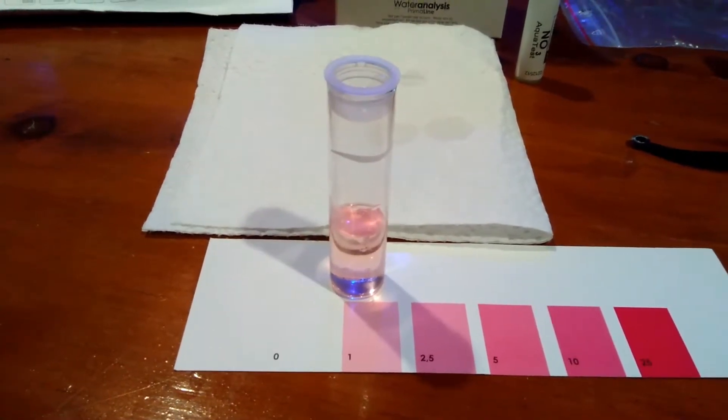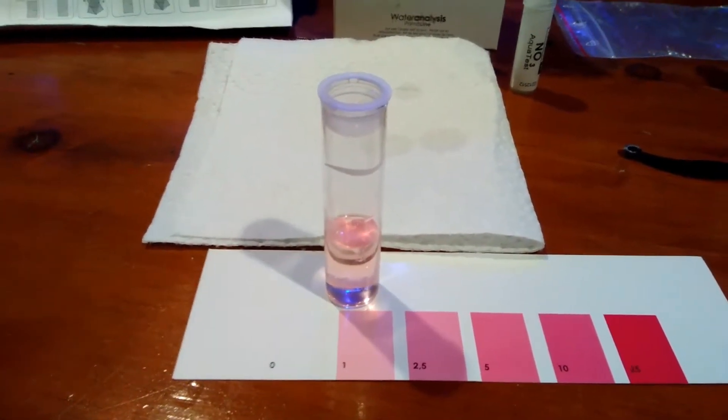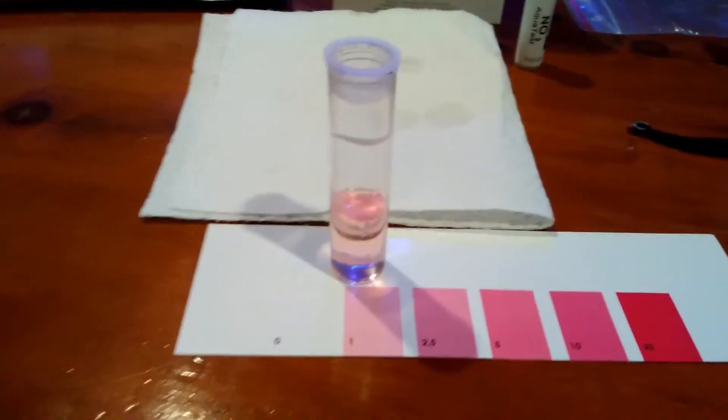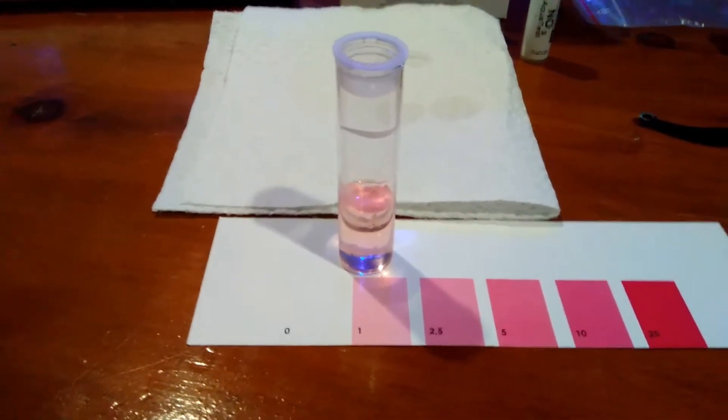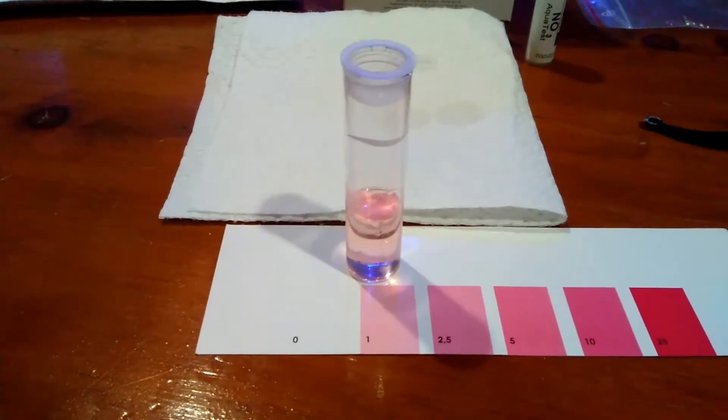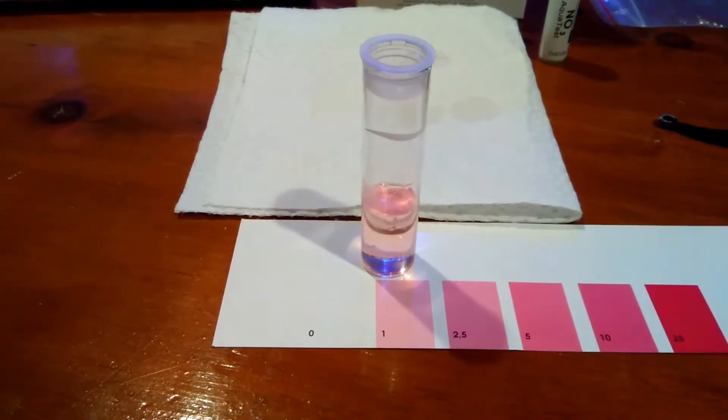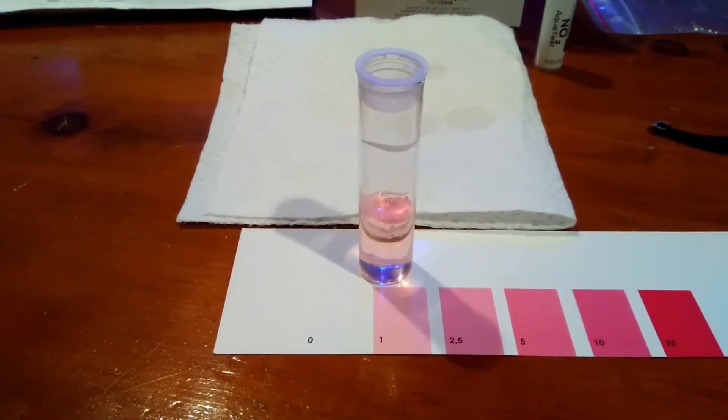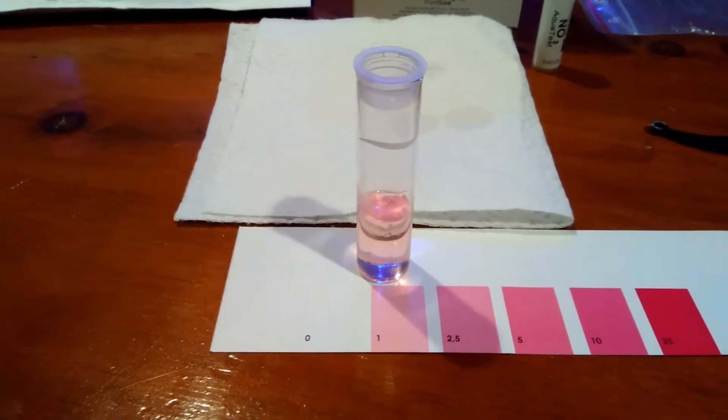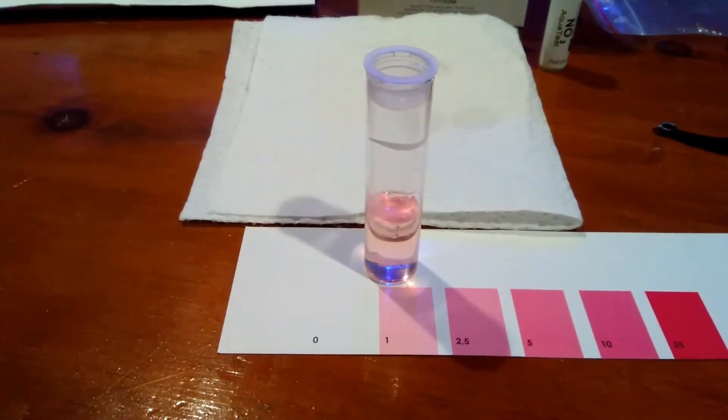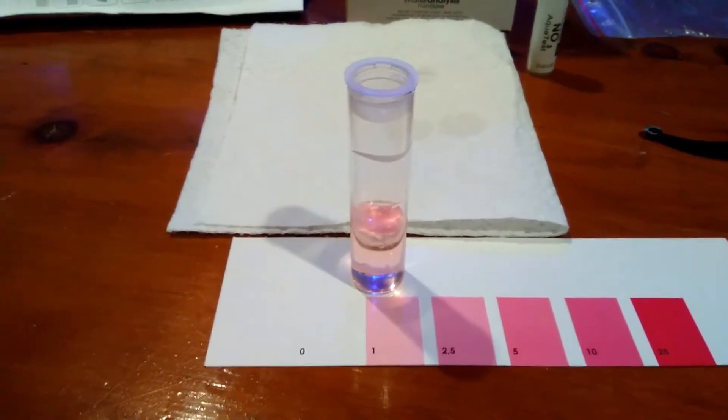If you get the API Pro kit like I did, it was great for a while. But the thing is that bottle number two, if you do not shake it correctly, perfectly, every single time, the powder that sticks to the wall inside bottle number two will actually throw the whole test kit off for the rest of the time that you have it. So if you're going to use that kit, be diligent about shaking it. That's all I'm going to say.